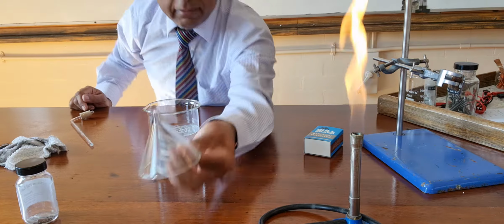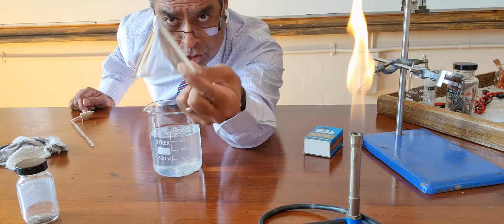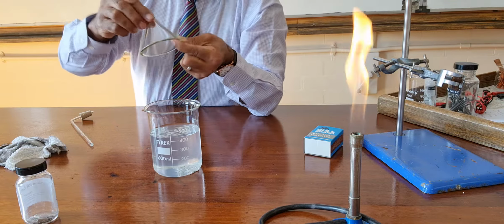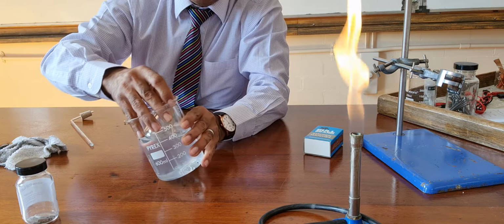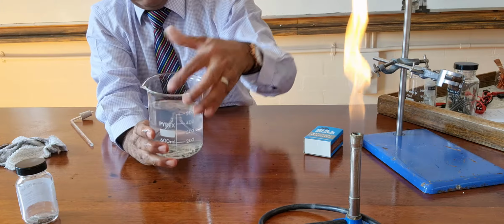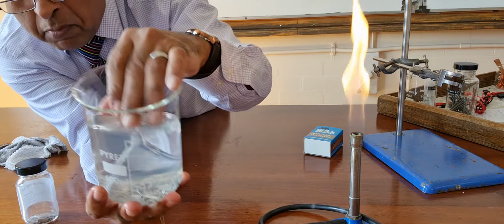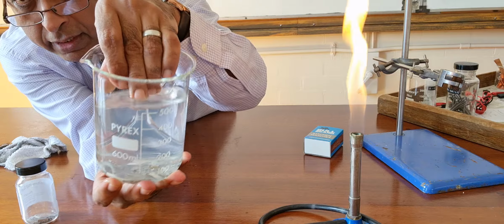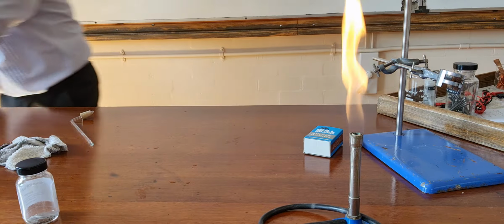I've taken a funnel, which I've broken the end off, a short spout funnel. What if I hold this over all of those pieces? Those pieces of magnesium are now underneath that funnel. Perhaps I need a bit more water.